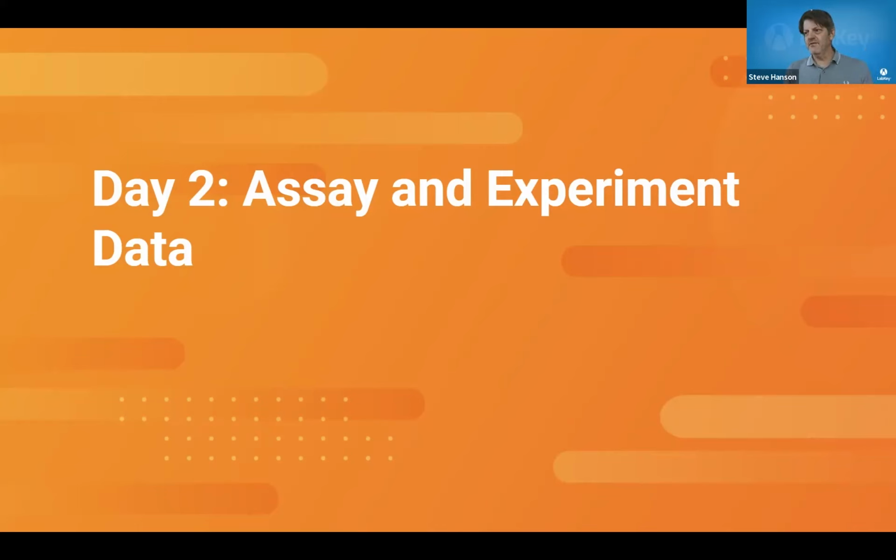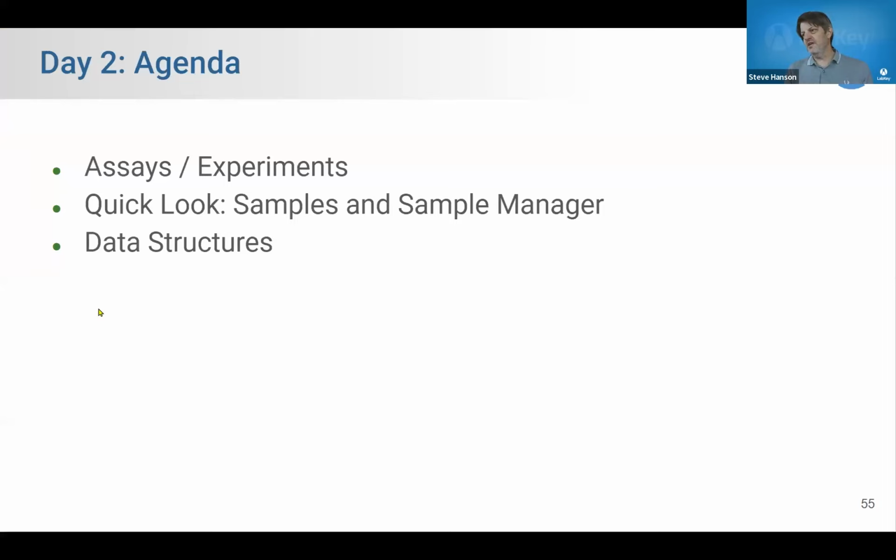I'm the Director of User Education here at LabKey, and today we're going to continue our agenda into day 2. Today we're going to talk about assays and experimental data and how to get it into the server the right way. And then the other main topic is data structures. So those are kind of the two main topics.